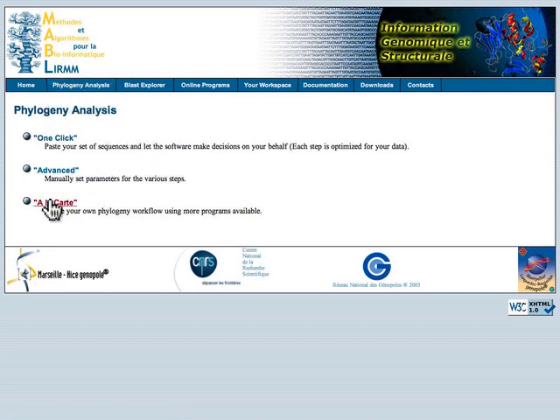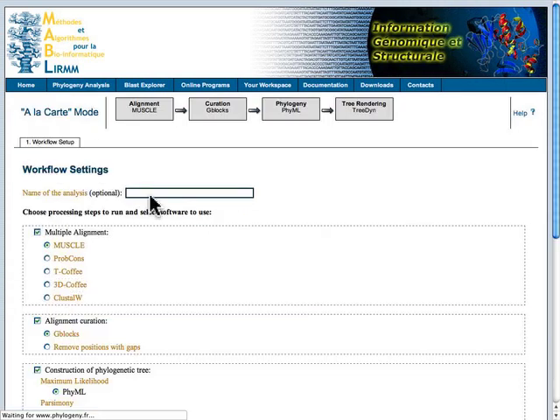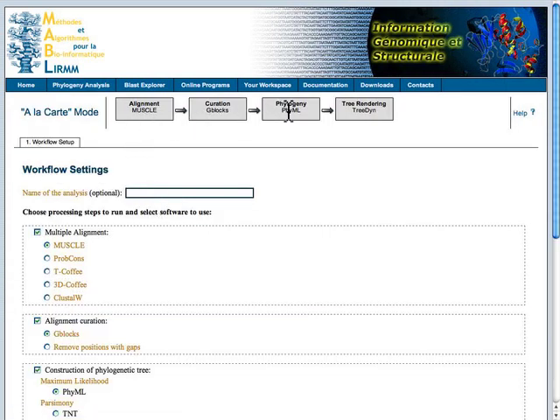For the purposes of this exercise, we'll be using the a la carte tools, meaning that we'll get to choose tools for each of these four steps of a phylogenetic analysis.